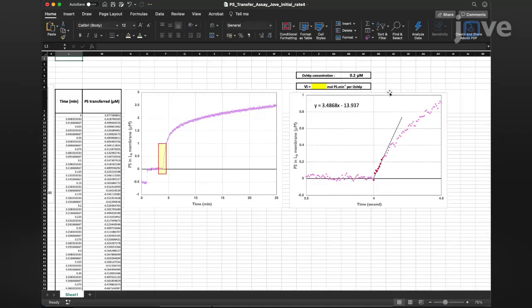It requires standard equipment and fluorescence sensors and liposomes that are easy to make. This method can be used and modified to get insight into cellular biology by unveiling the proteins behind the distribution of some essential lipids between organelle membranes.